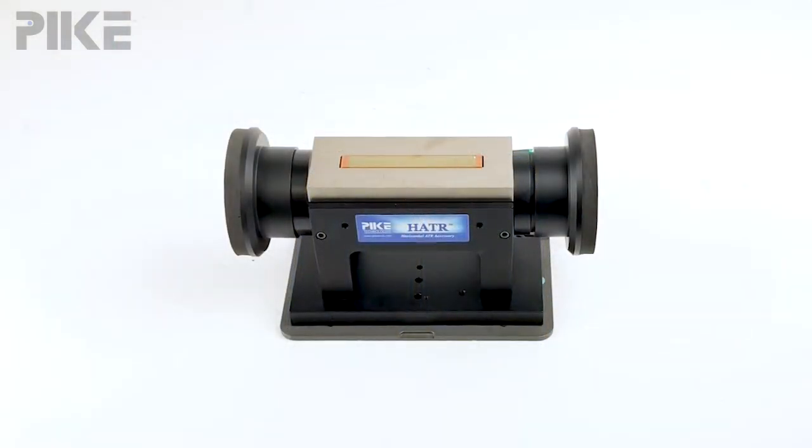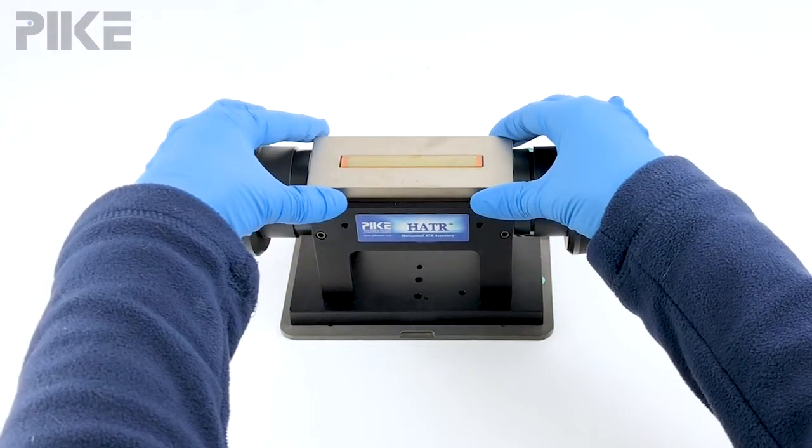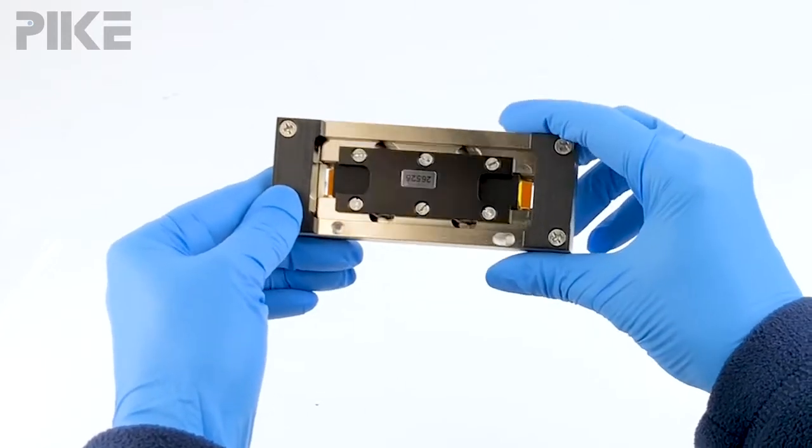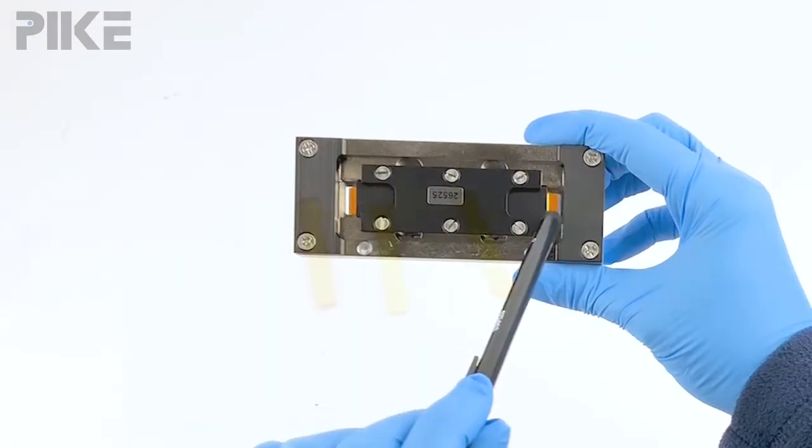To determine the number of reflections of your HATR plate, the first thing you'll do is remove the ATR plate from the base. Next, flip it over and we're going to look at the ends of the crystal.